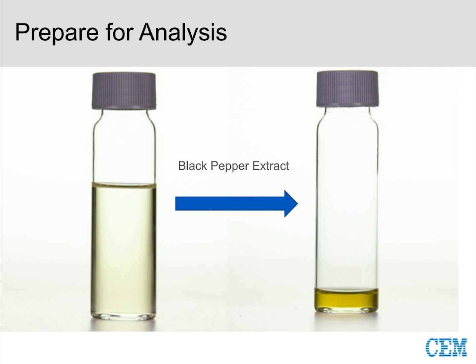It depends on the sensitivity of your analytical instrument, what concentration you want to run at. So in this particular case, at the concentration we spiked at, that 30 mL extract would be around 33 ppb. So if you're okay with just looking at that, you could go direct to analysis in that case. And in our situation, we desired to concentrate down to that 5 mL mark and then go to analysis from there.